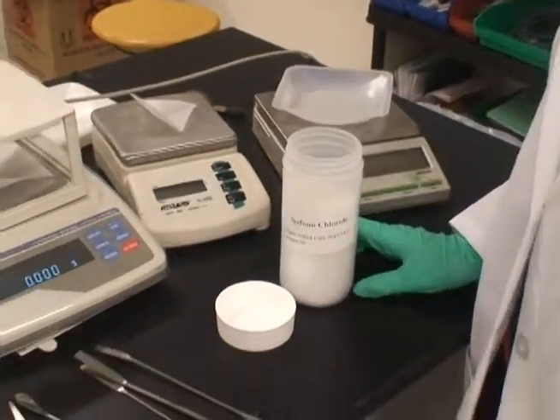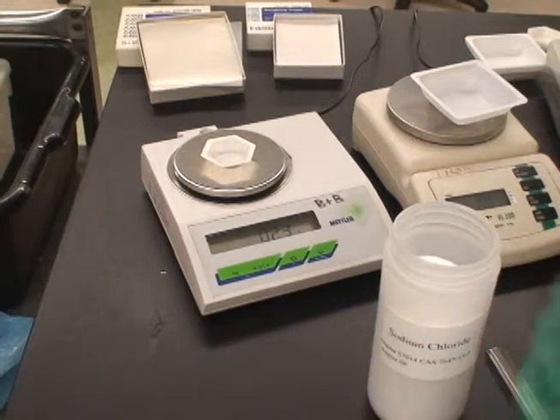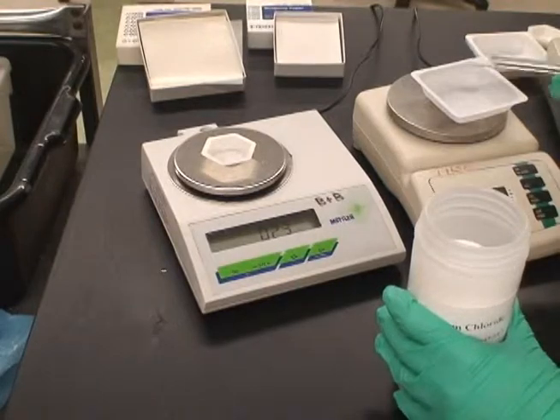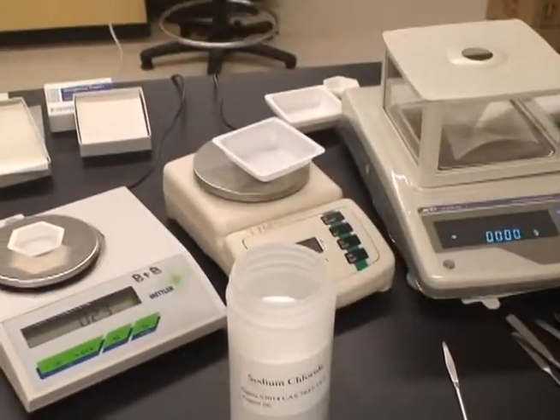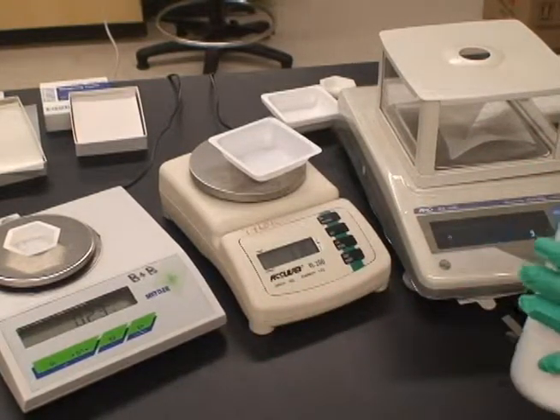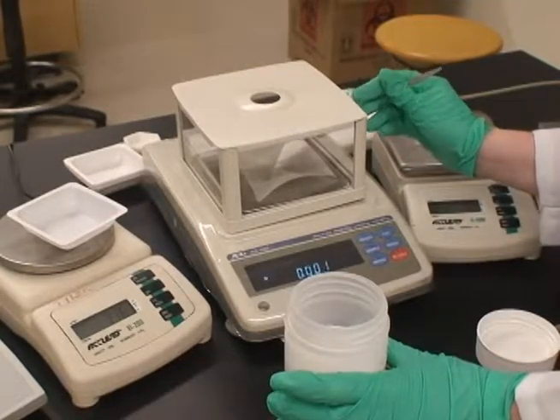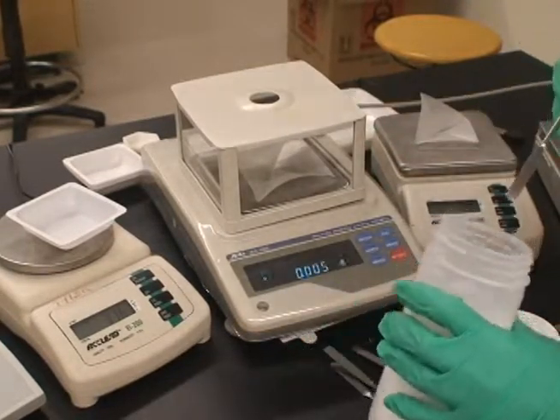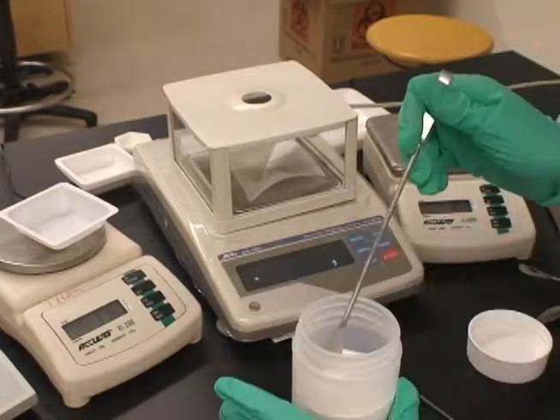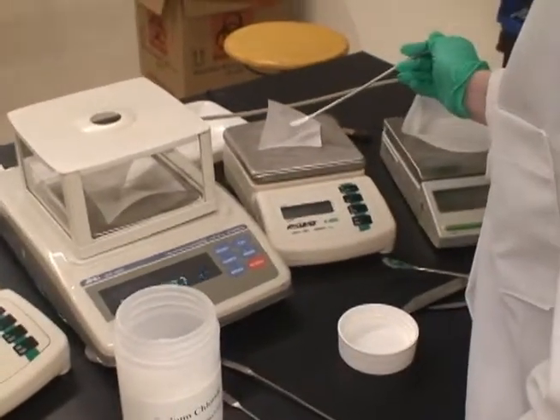Balances all have different capacities. Not all have a minimum capacity, but most do have a maximum, though it's rare that you'll ever put that much on a balance. The differences between most balances have to do with how accurate they are — they can be precise from a tenth of a gram to a ten-thousandth of a gram. Most balances automatically weigh substances in grams, but some do not. If you seem to be adding a lot of weight and you're still at part of a gram, you're probably not measuring in grams, and you should check the units on the scale.